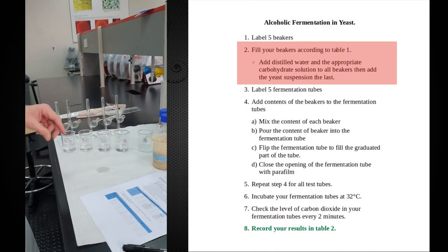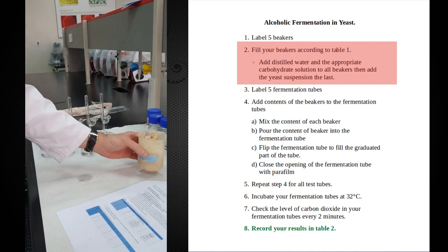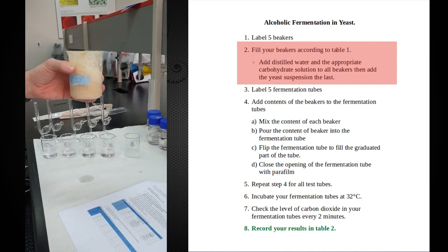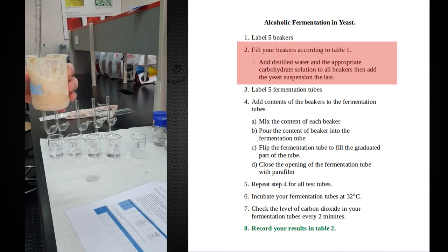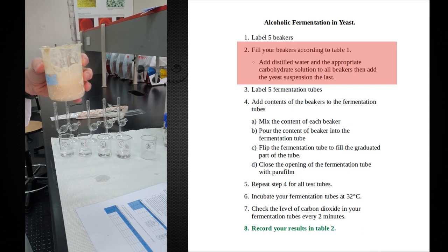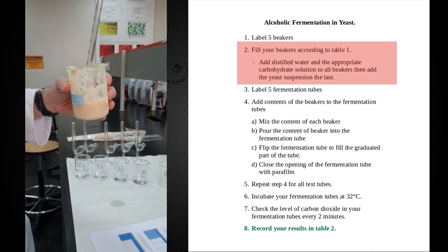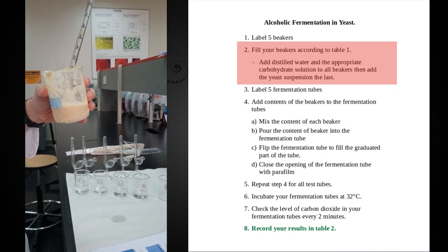Now adding the solutions to the beakers. We have the fermentation solution and water. I'm just going to be adding the yeast suspension at this point. Our yeast is sitting in here. It's a bit of a mess because they're already starting to ferment. I'm going to make sure that I take a fairly uniform sample for each one of my beakers, so I'm going to mix it up well, and then I'm going to take my 15 milliliters.